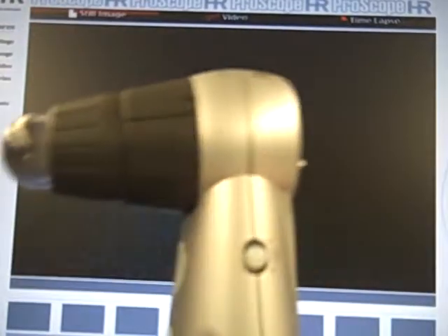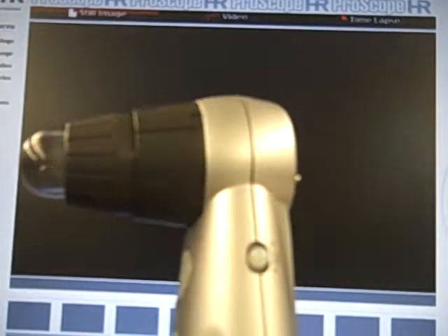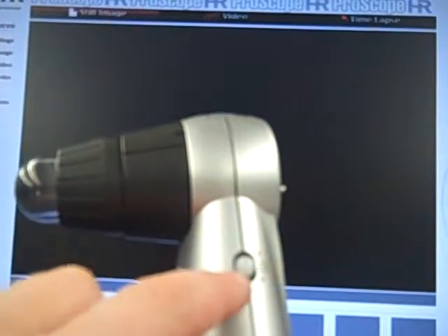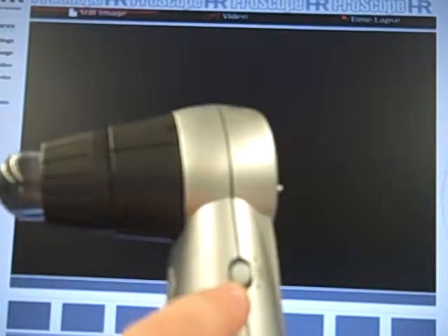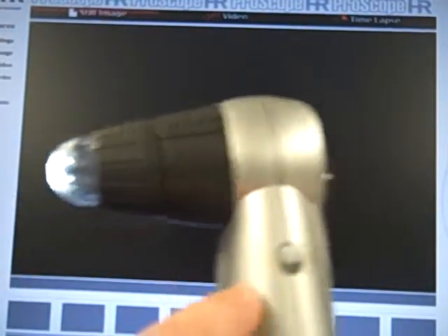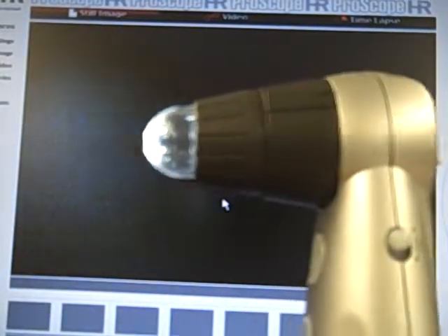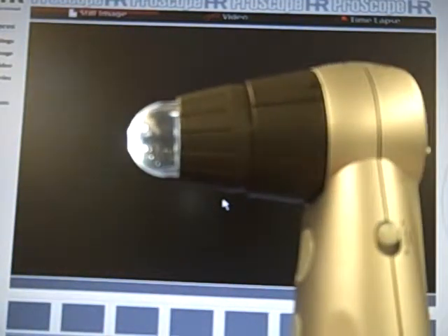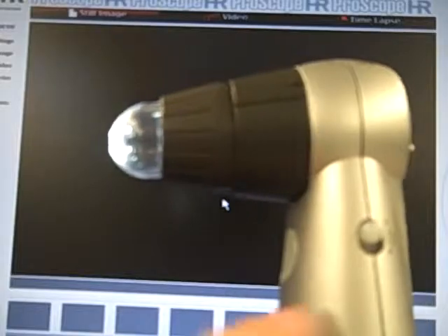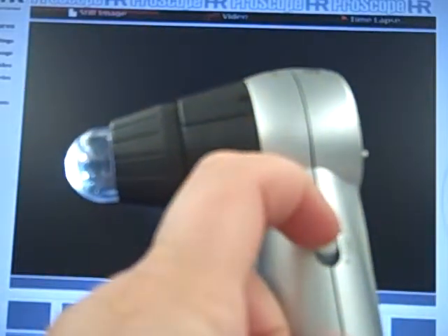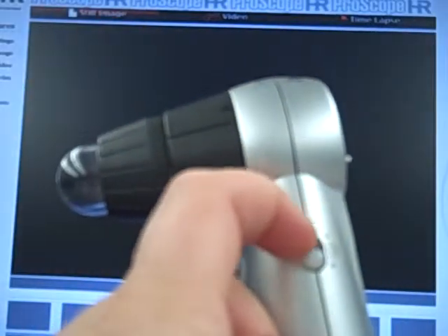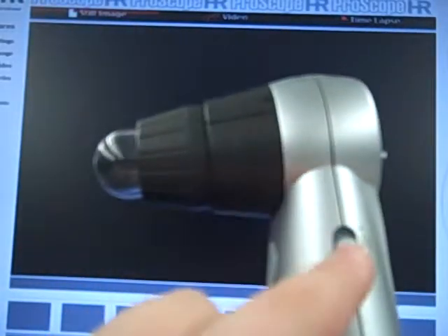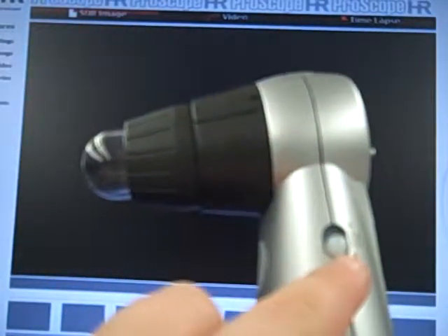I'm going to leave the camera up here on the screen. This right here has a few different settings. If you flip the side button up to A, you get a light that shines and that kind of illuminates things. Off is no light and B is kind of like a backlight.